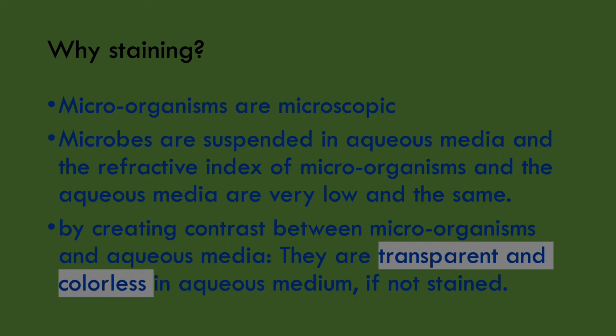Also, the refractive index of the microorganism and the aqueous media are very low and almost the same. Due to these reasons, we use the staining technique for a better visualization.